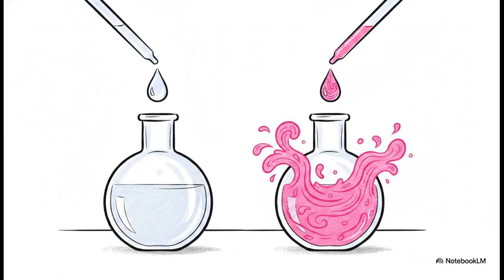If you drop it into an acidic environment, like the lime juice or the vinegar, literally nothing happens. It stays completely colorless. But the very second you drop it into a basic environment, like our dilute sodium hydroxide, it flashes this bright, striking pink. It's an incredibly dramatic visual confirmation of a base. You really can't miss it.